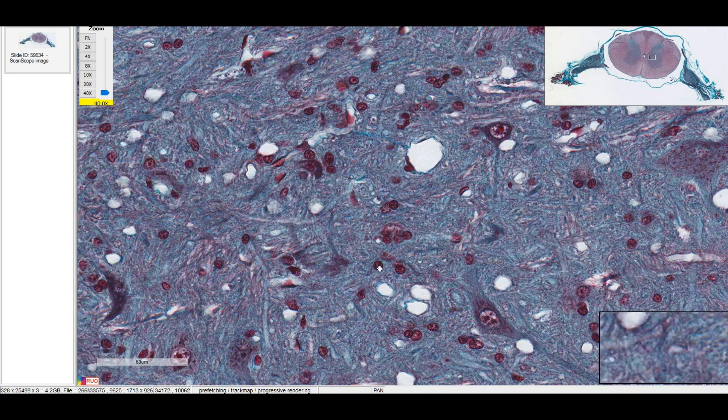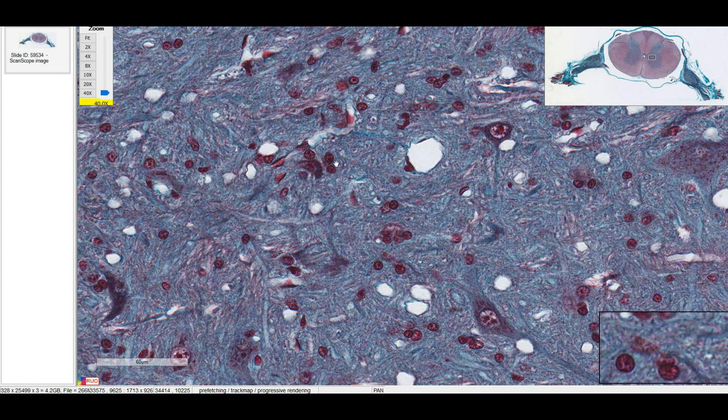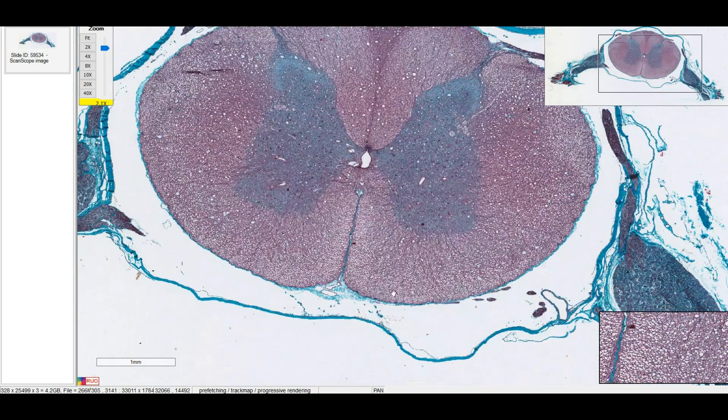Remember that these glial cells can be many different types of cells. It's mostly oligodendrocytes or astrocytes here. And I can't really tell the difference between those two. The lab manual doesn't seem to make a big deal about differentiating the two on this slide. So I wouldn't worry about it. Anyway, we can see the astrocytes much clearer in a different slide.